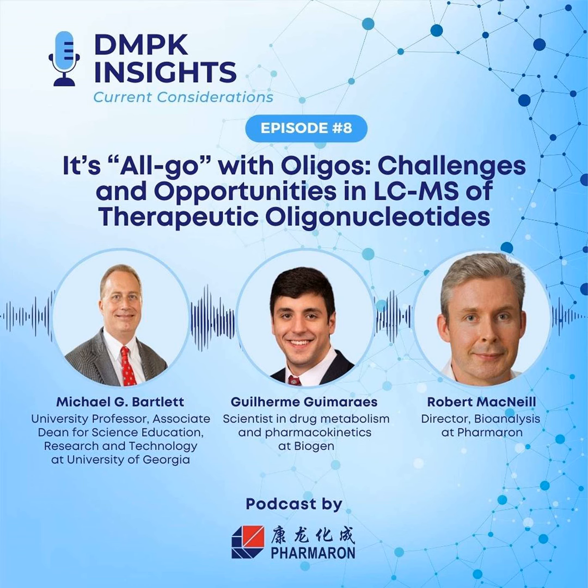And I think for targeted, it all comes down to what's your interest here. So if you have a very targeted analysis, I think the capture strands are going to work really well. If you need to capture a wider slice of things for like impurity analysis or even total metabolite ID, then solid phase extraction is going to be the way to go there. But once you sort of know what you're looking for, I think the capture strands have a real place here in the sample prep. Very interesting.